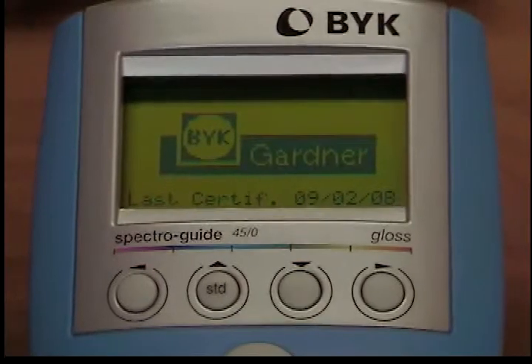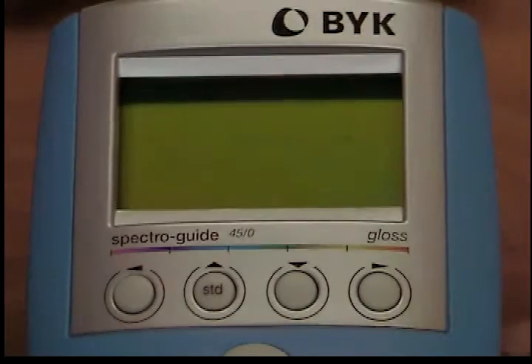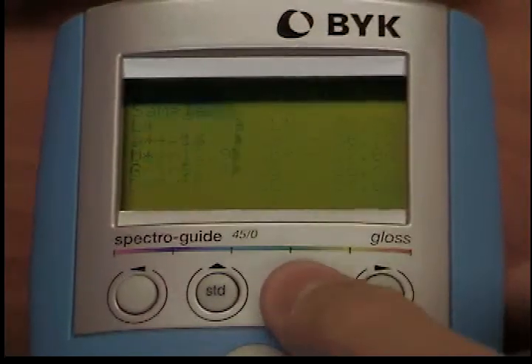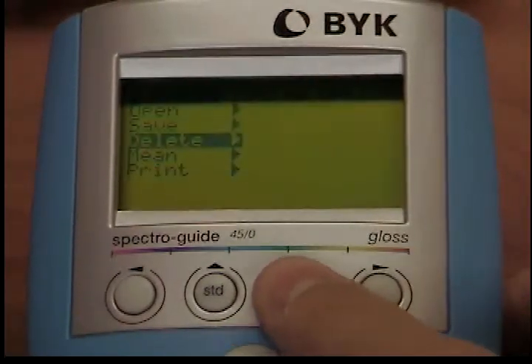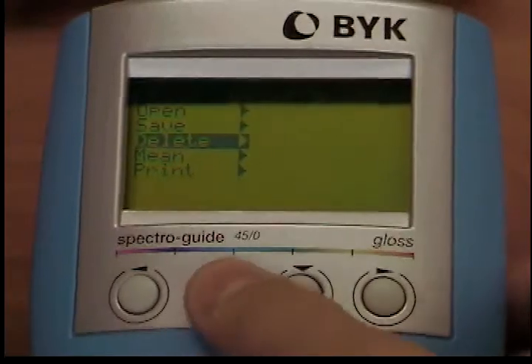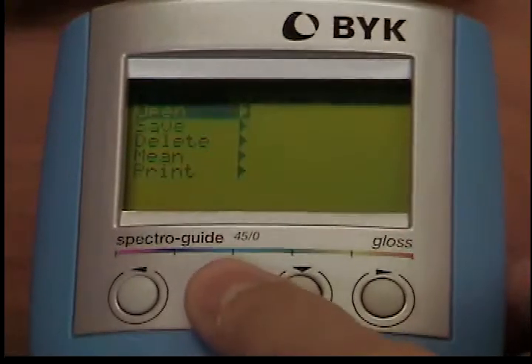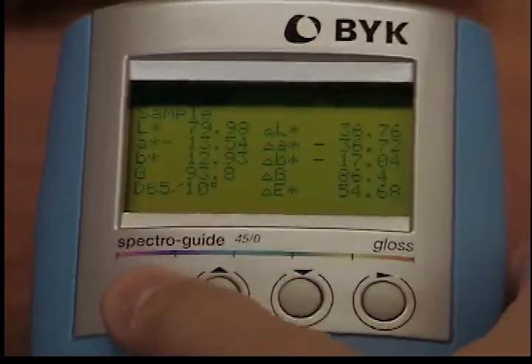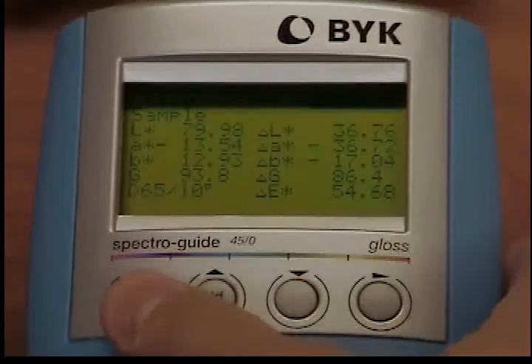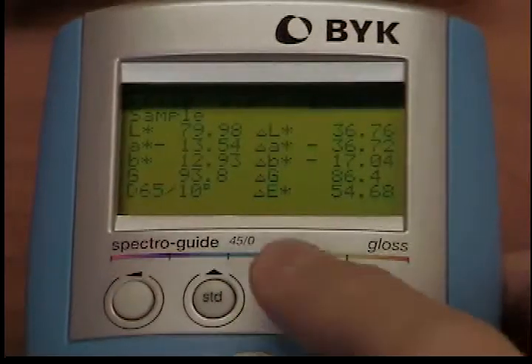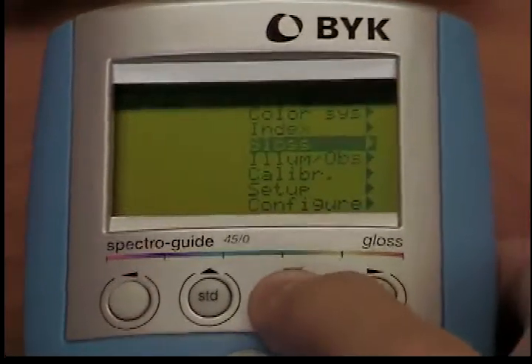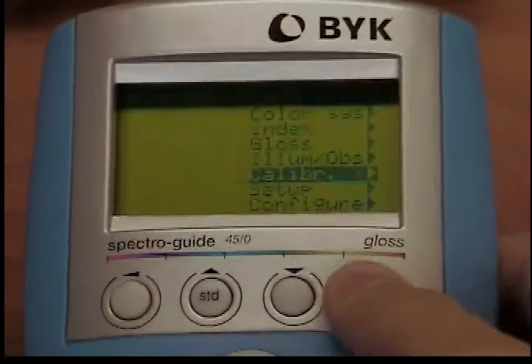From this menu, use the down button to place the cursor on the calibrate option. Press the operate button. When the sub-menu opens, use the down button to move the cursor to the calibrate option. Now press the operate button.